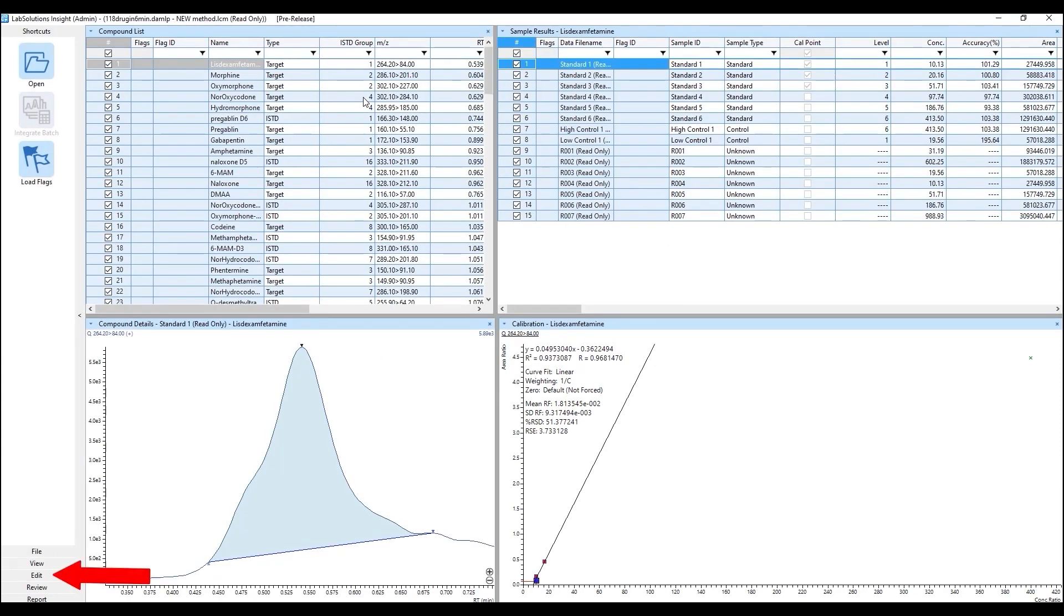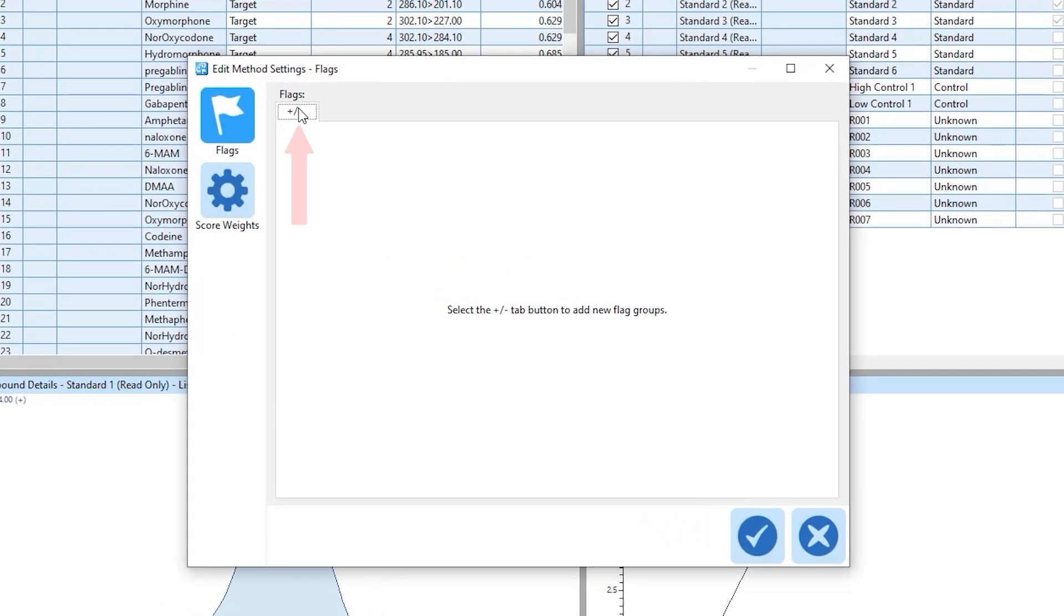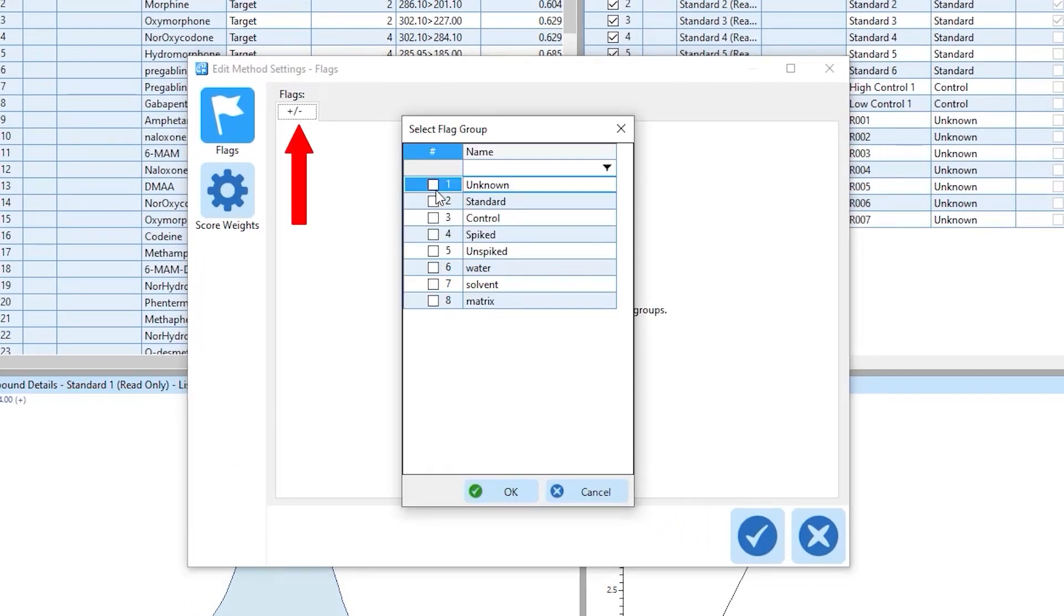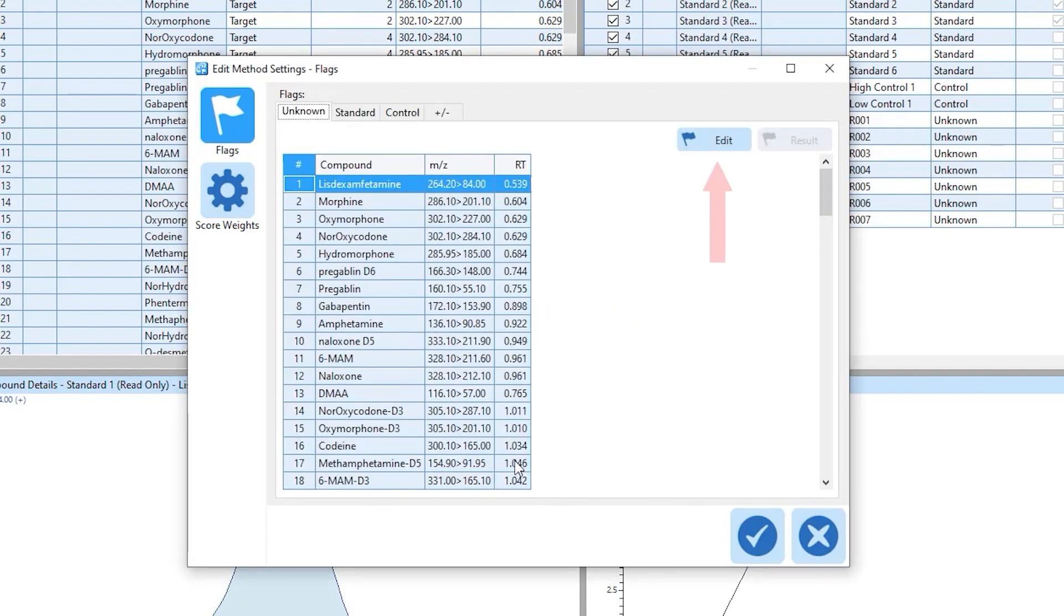Select edit flags in the edit menu of Insight to make new flags. Select the plus minus tab to add the flags for specific sample types, then select edit to add the types of flags that will be evaluated for the sample type.